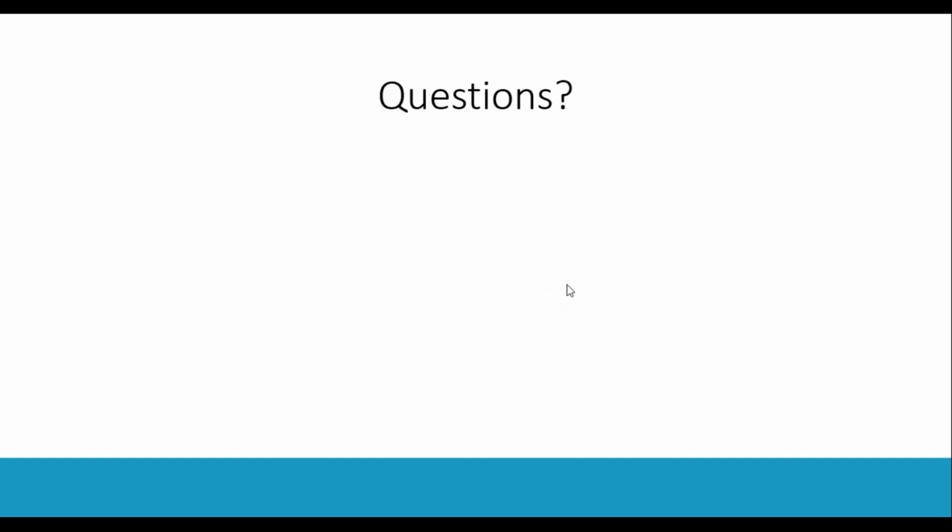Okay, thank you. We'll just wait a few more moments to see if anyone else wants to submit a question for us. Oh, great, another one from Ji Chen. Do you need to do a full cycle, or can you do a half cycle for BET calculations?